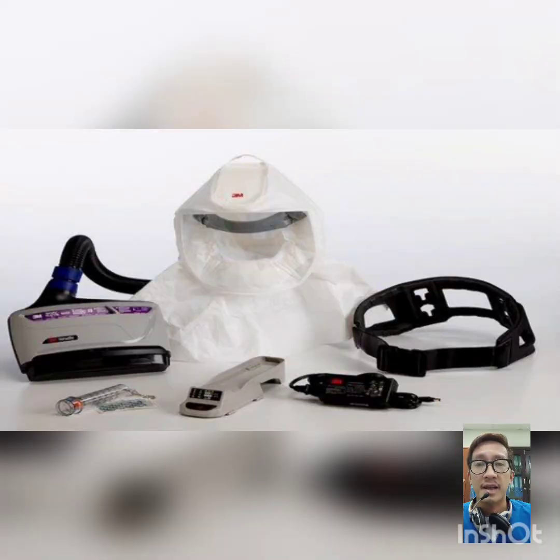As you can see on the slide, that is your PAPR, or powered air purifying respirator, parts and device. So that ends my lecture for fit testing. In the following slides or following video, you will see how we do fit testing and how to don and doff your N95 mask.